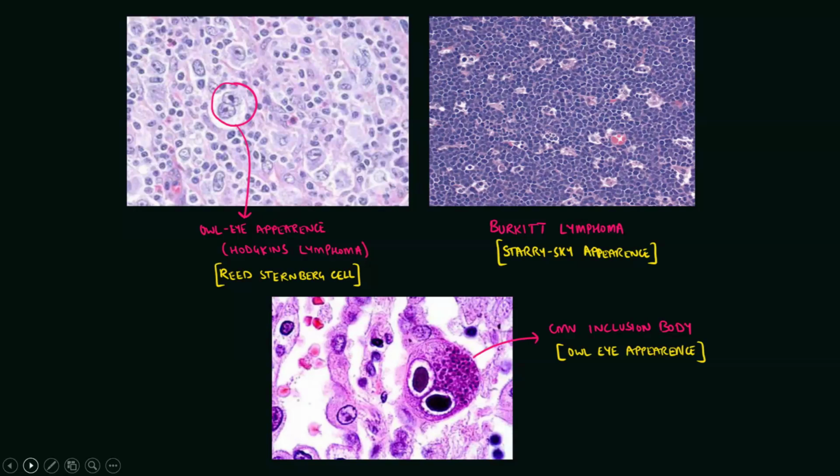For the owl eye appearance, like in Hodgkin's lymphoma, it is right now shown in a small view, right? So over here, when you have a slide of CMV inclusion bodies, over there you can see in a zoomed manner that is the owl eye appearance.